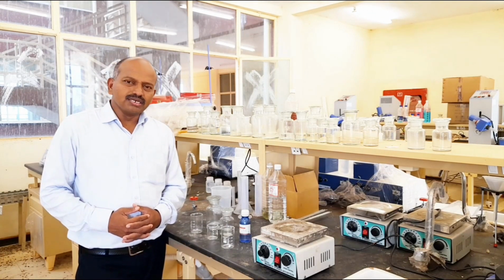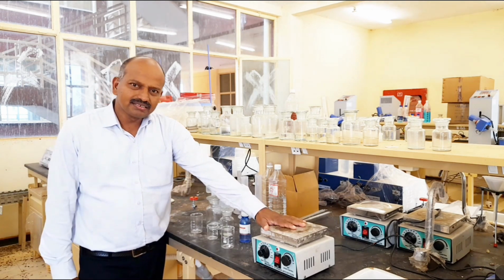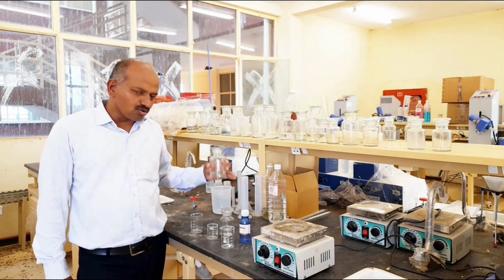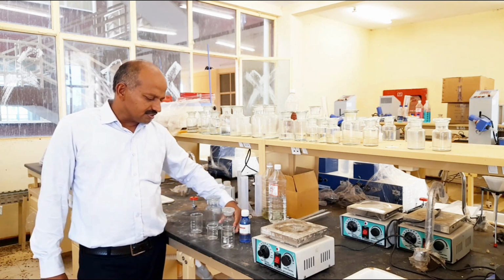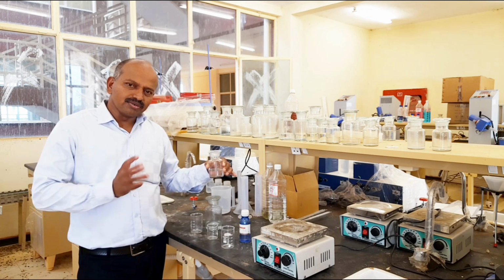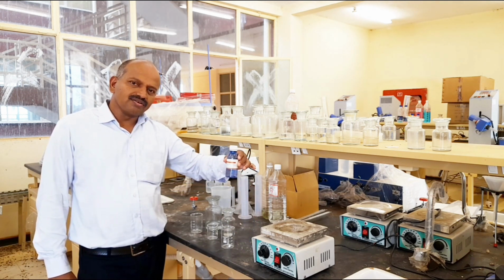Now we have come to the experimentation spot. This is the workbench. This is the magnetic stirrer, which we will use for stirring the solution. This is the reagent bottle containing hydrochloric acid of known strength. This is the mixture containing sodium chloride and sodium hydroxide solution. And this is the indicator, phenolphthalein, which is used to identify the color change.